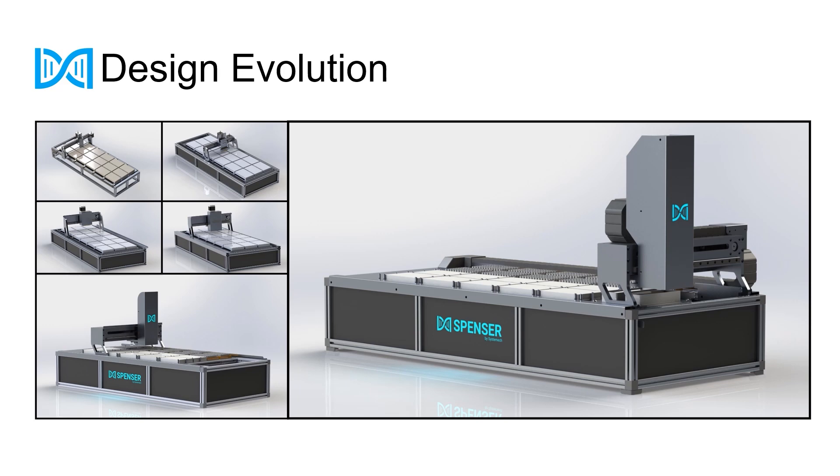Now we'll discuss the design of the machine. We have gone through many iterations and have arrived at a final design which is both elegant and functional.